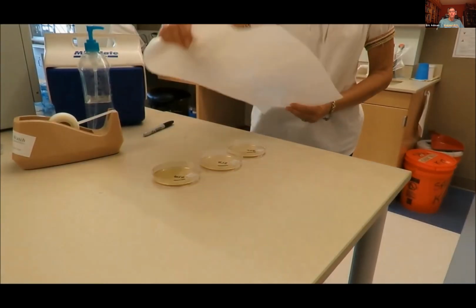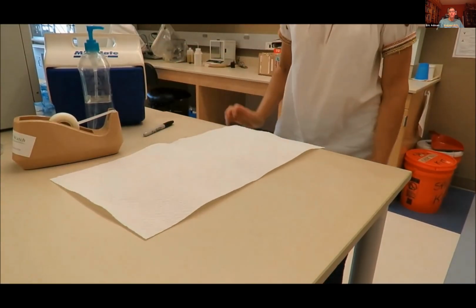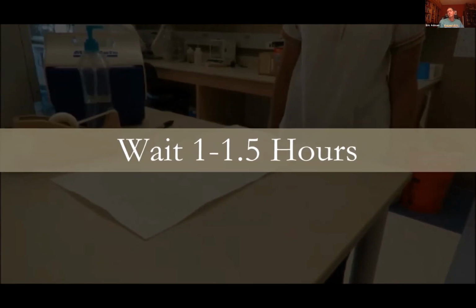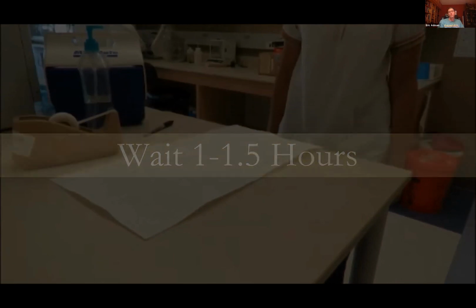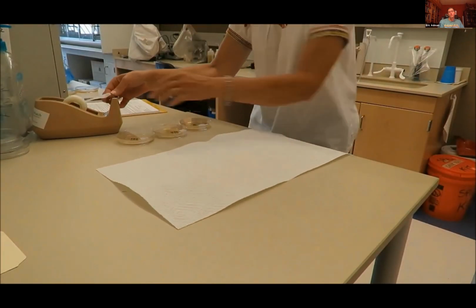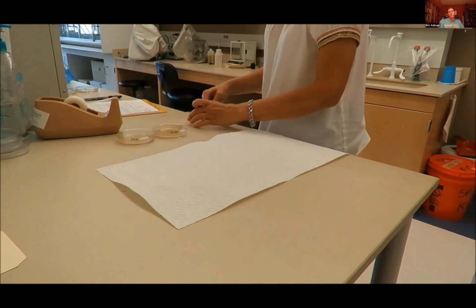Be sure to shield the sample plates from direct light. Leave the plates undisturbed until the media has gelled, usually about 1 to 1.5 hours. After the media has gelled, use another piece of tape to secure the untaped side of the dish.